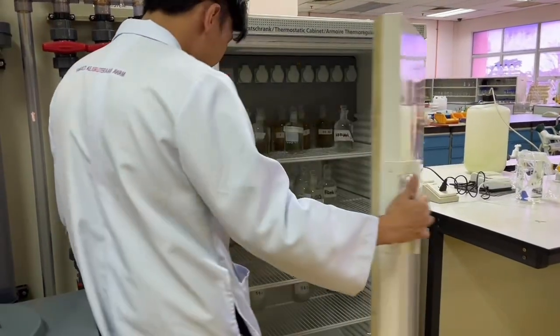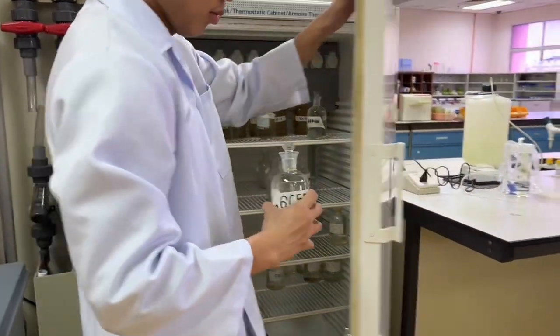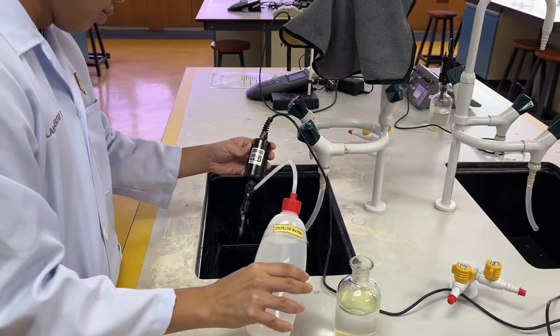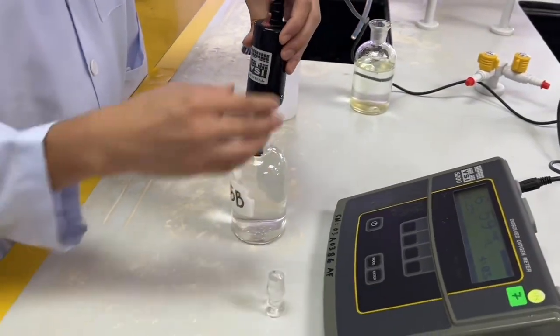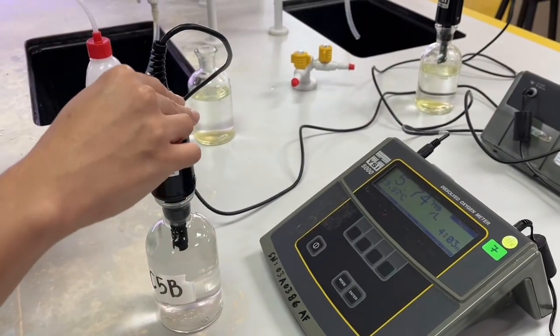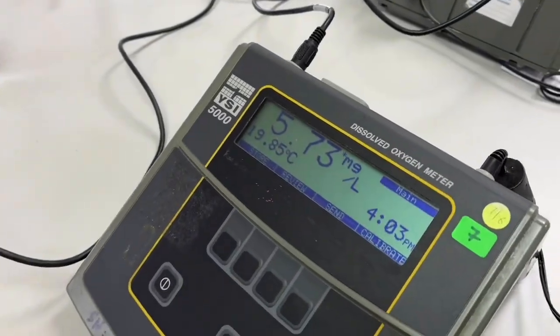After 5 days, repeat the same process using the DO meter and take 3 readings to get the average value of DO5. Lastly, by using the formula of average DO0 minus average DO5 divided by decimal volumetric fraction of sample used, we will get BOD5. With the value of BOD5, compare the result with the Malaysian standard.